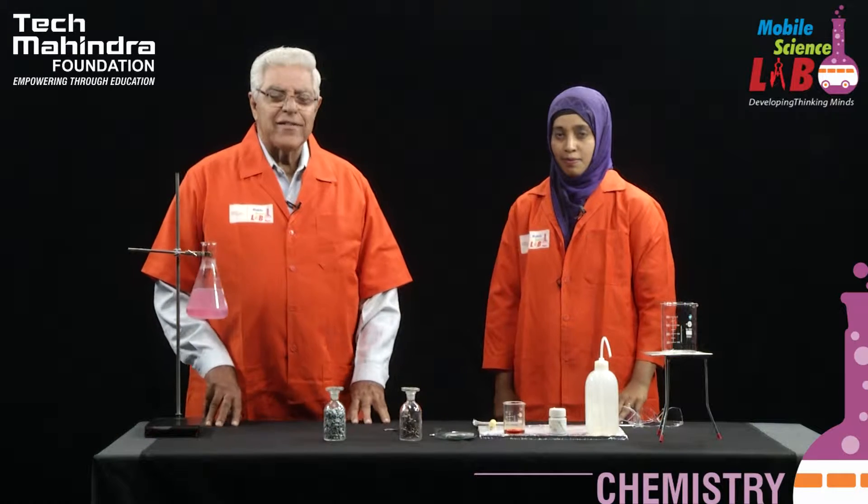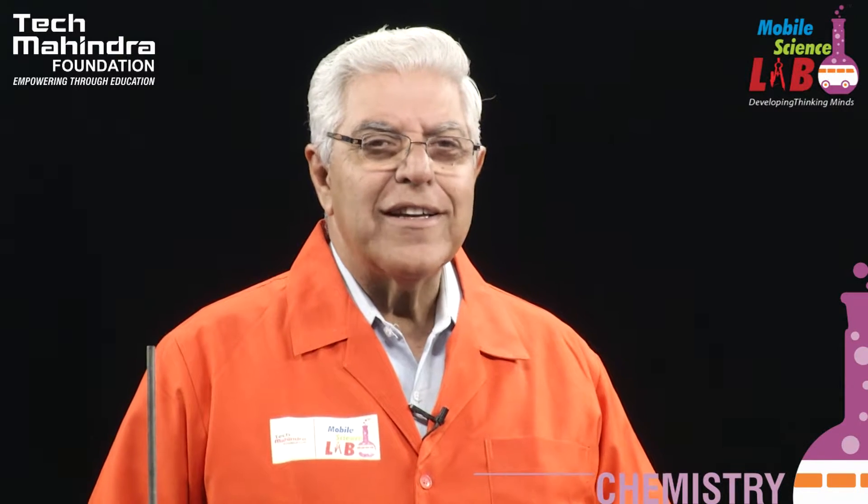Viewers, today the Mobile Science Laboratory is presenting a very unique series of experiments in which we are going to make use of metals. Khatija and I are going to do these experiments. Just to give you an idea of what we are going to do: first, we have got a few representative metals over here as you can see.